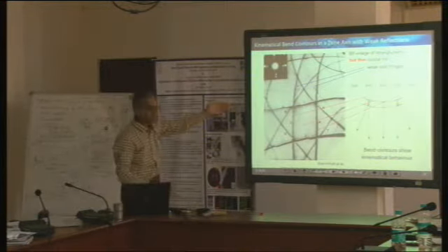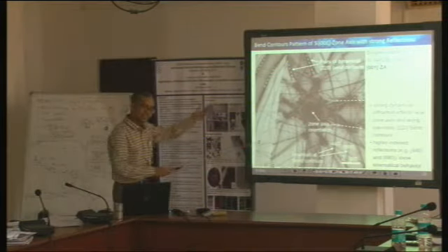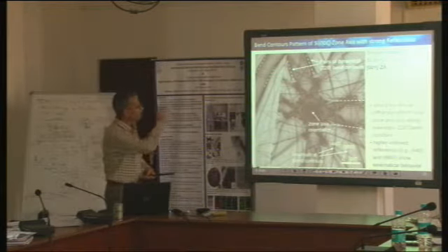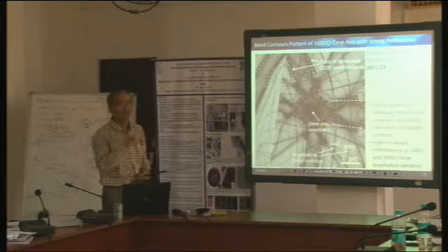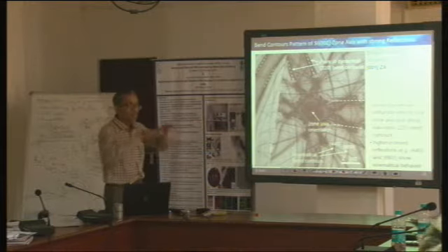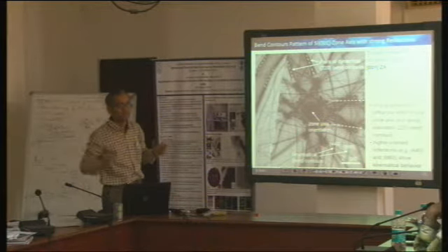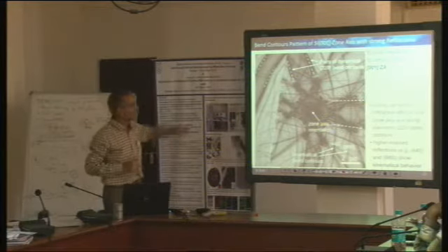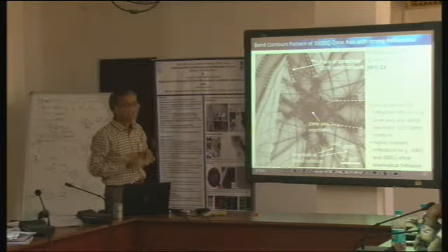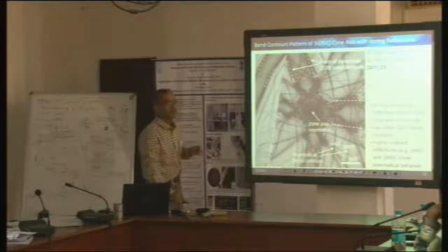But when I take the same sample in a thicker area like this, it becomes very complicated. Now it is difficult for me to draw any analysis, isn't it? This is because my sample has become thick. Those nice individual fringe patterns which were coming are no longer the case. So many effects are overlapping with each other, and that's why these strong dynamical diffraction effects come up.